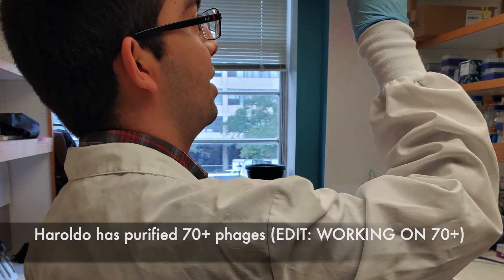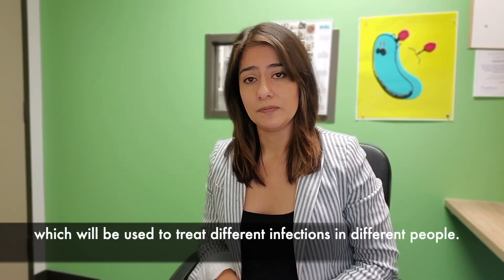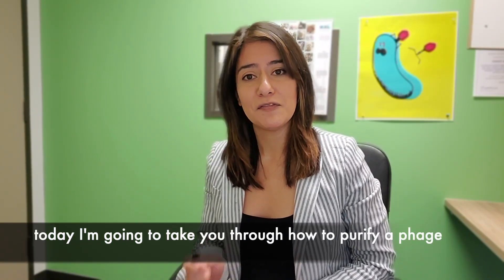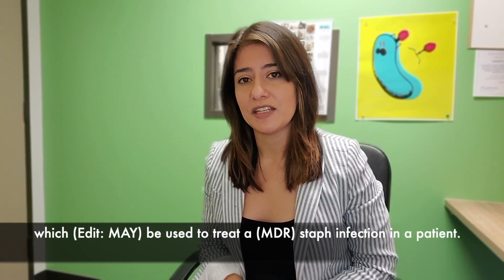Our technician Geraldo Sanchez has purified 70-plus phages, which will be used to treat multiple infections in different people. Today I'm going to take you through how to purify a phage starting from the beginning, starting with a Staph aureus phage, which will be used to treat a Staph aureus infection in a patient.